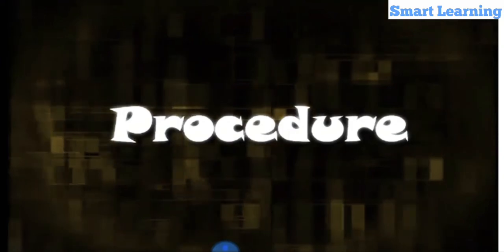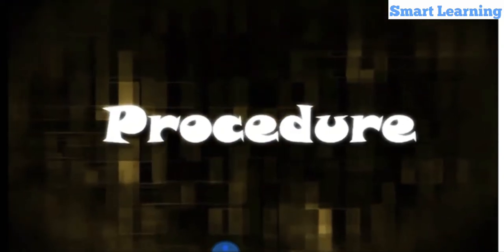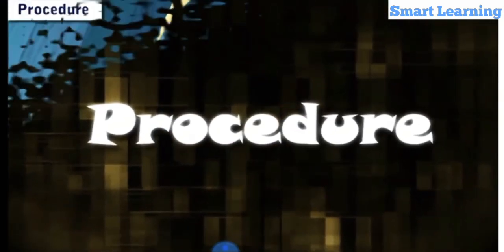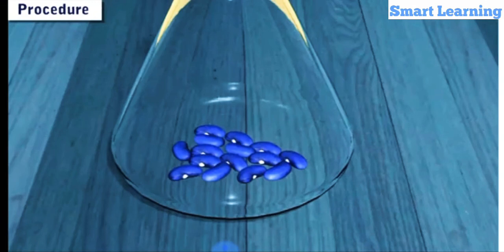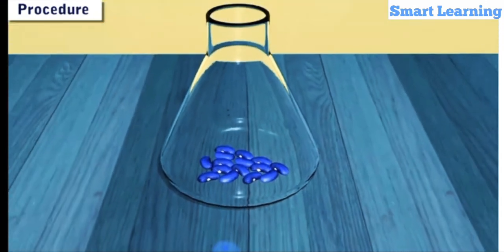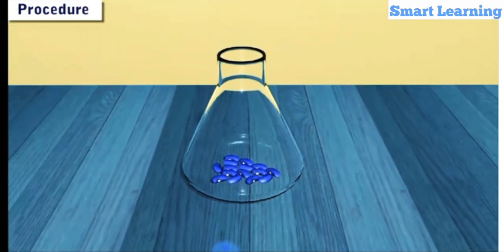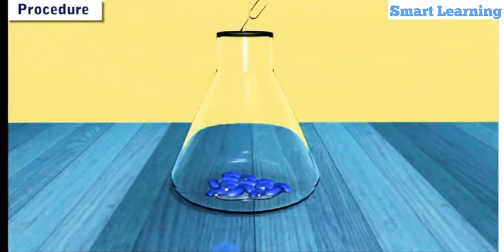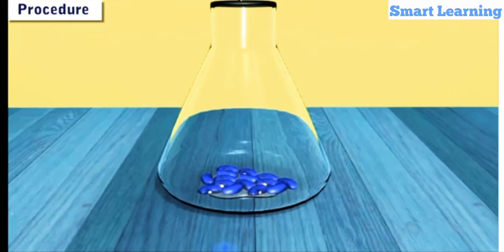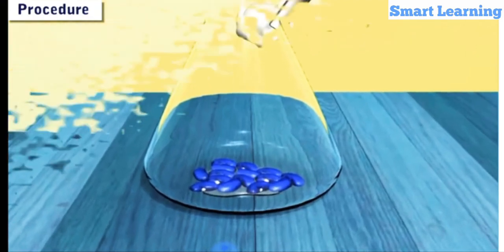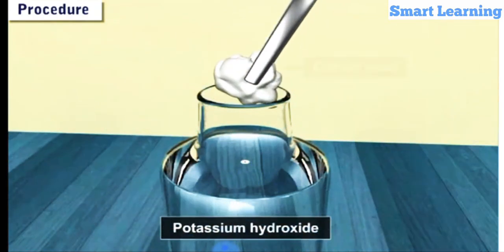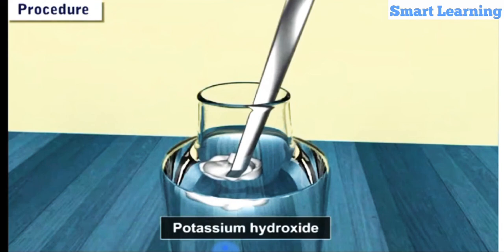Procedure: Take some germinating bean seeds in a conical flask. Sprinkle a few drops of water on the seeds to keep them moist. Dip cotton wool in potassium hydroxide solution.